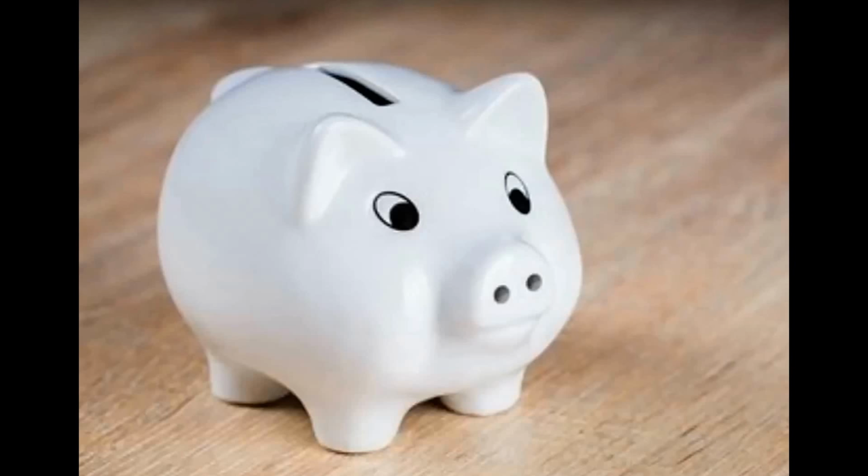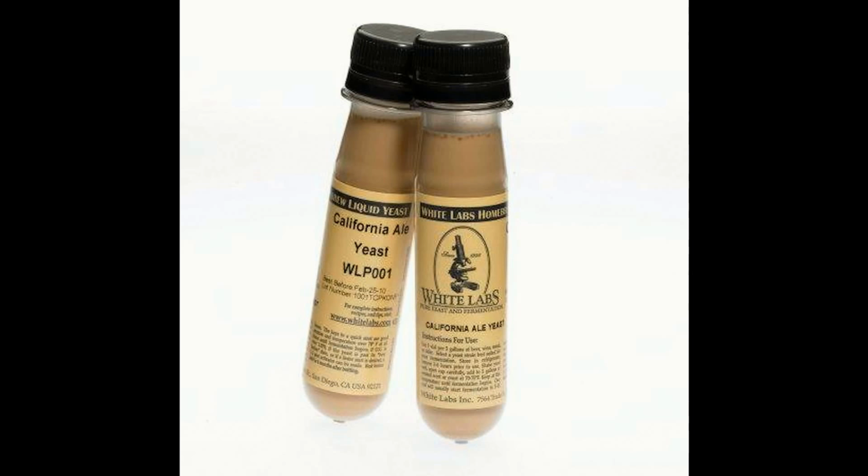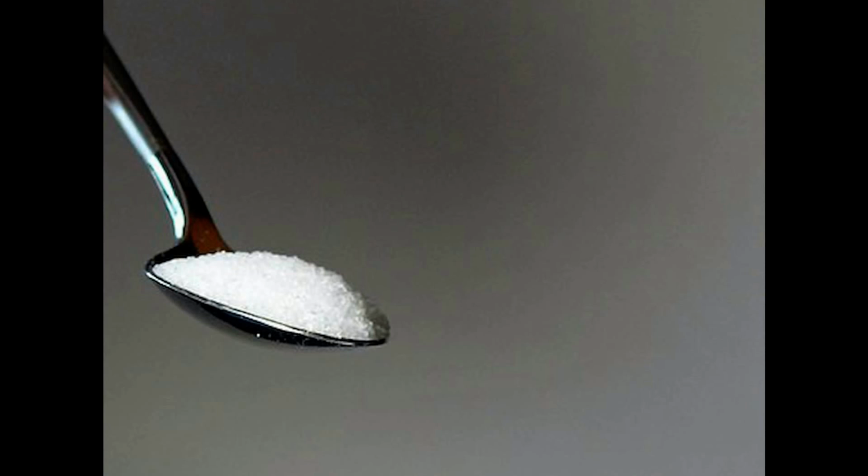Either go the yeast storage route, and you'll find information on that here. Use it as is, but this requires familiarity with the rate at which you need to pitch the quantity of yeast you have cultured. Finally, you can continue to add sugar and yeast nutrient only to this vessel.